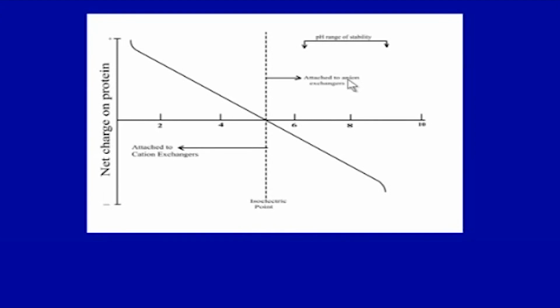So, this protein would be chromatographed on an ion exchange column using a buffer adjustable to pH 6.3 to 8.4. Accordingly, if the protein is anionic at the particular pH where it is stable, then it has to be purified on an anion exchanger, and here 6.3 to 8.4 is the right pH range that needs to be utilized.